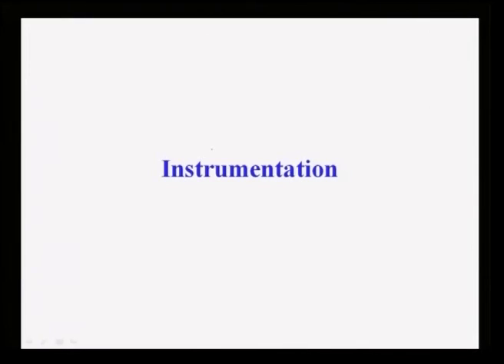So in the last few minutes I am going to discuss instrumentation. What I have shown you in a nutshell is XPS as a technique to be used for fingerprinting: you can detect certain elements and the electronic states of the elements present very well, and we can also distinguish the spin orbital splitting of a particular orbital like 2p or 3p, or even f and d orbitals, very clearly. I have shown you that. Then we can use XPS to measure compositions very well. I have shown you how it can be done.